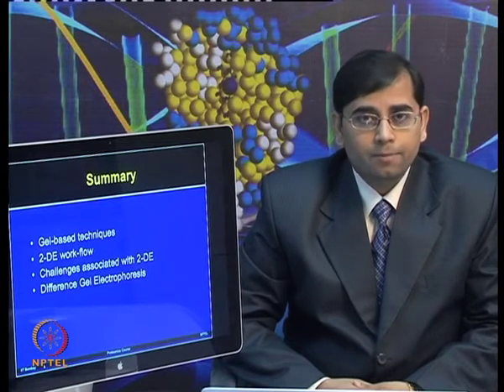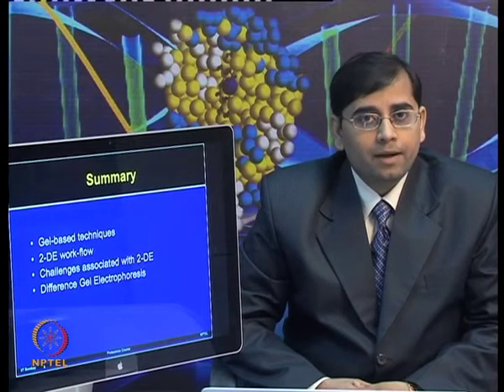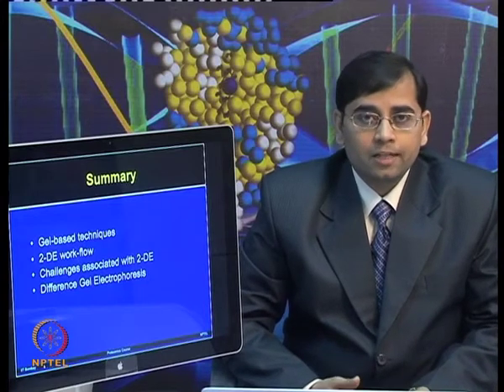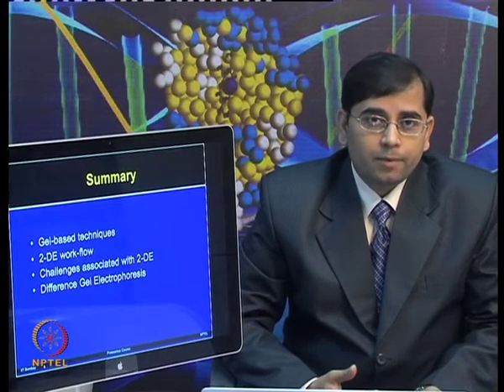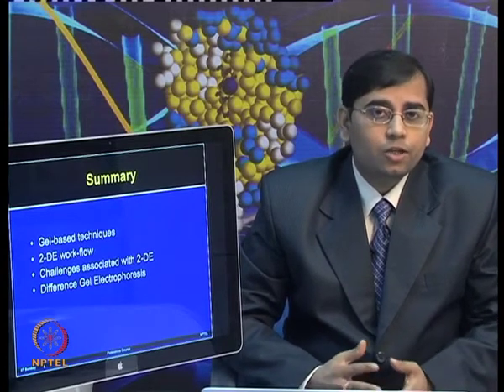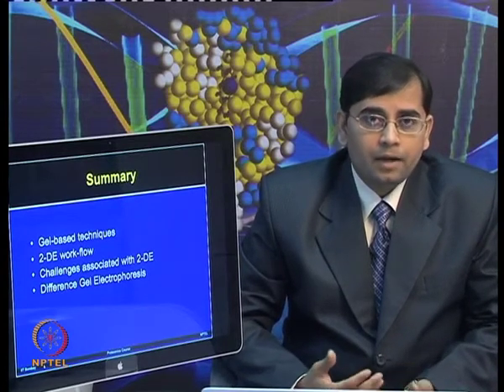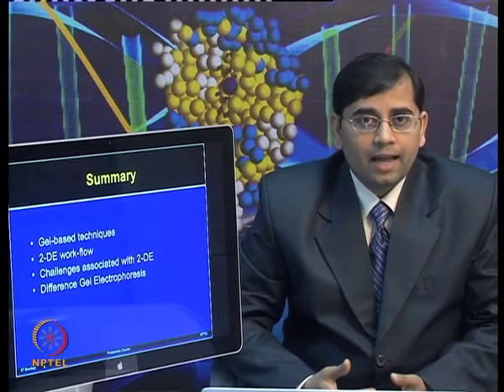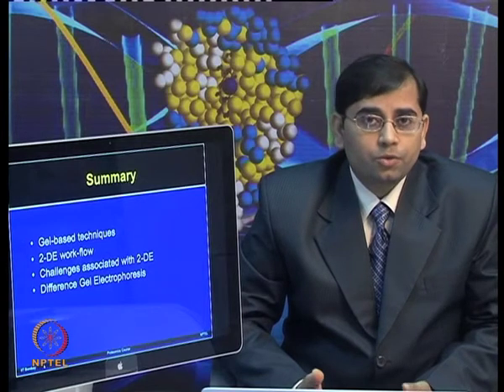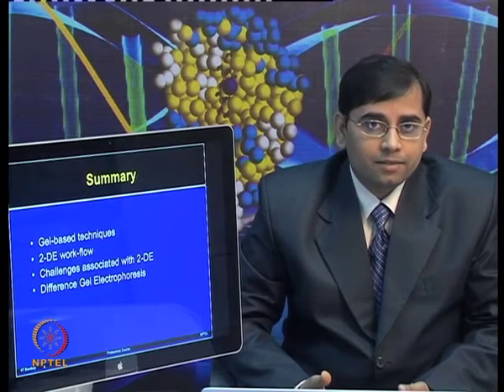I hope that at the end of this module and lecture you will be able to perform a gel based proteomics experiment, but please keep in mind these protocols and methods are only giving you a feel for performing these experiments. Each experiment, each sample type, each biological question brings its own unique challenges, and depending upon those conditions and your sample type, you need to optimize these methods.